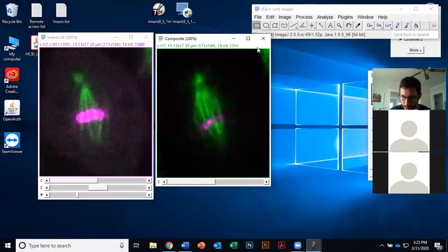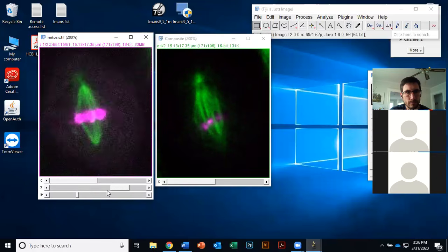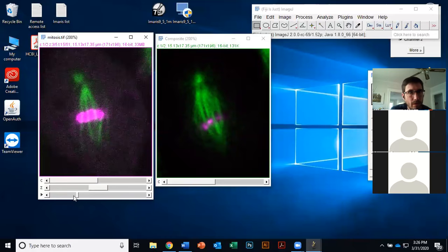Cool. I think it's not exactly matching. I think it's on a different Z plane. No, or a different time. Yeah, well.